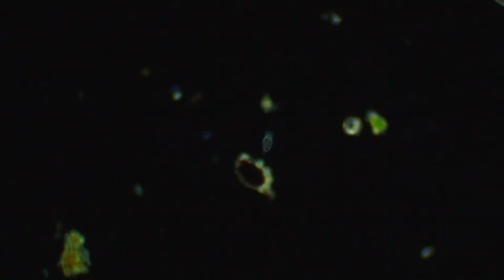The little things at the end, which look like little wheels. He's the wheel bearer. That's what rotifer means: wheel bearer. And he sits there and cleans the water with his little spinny wheels. And you can see, there you go. Yeah, you can see him sucking up the water.